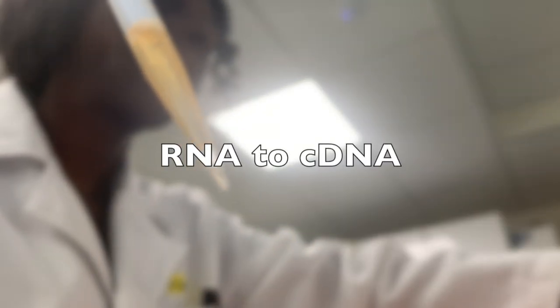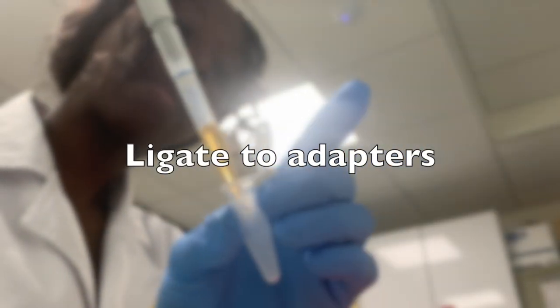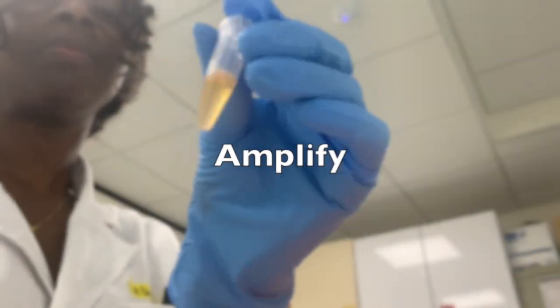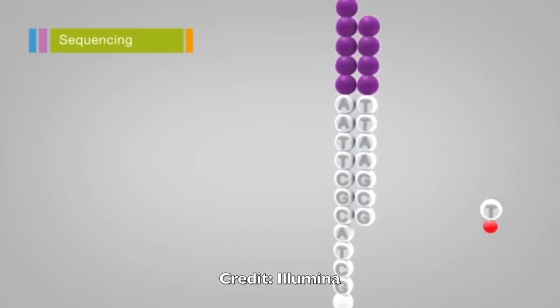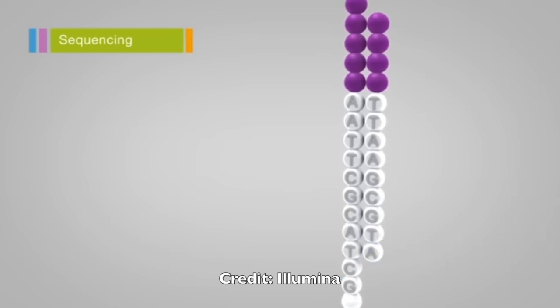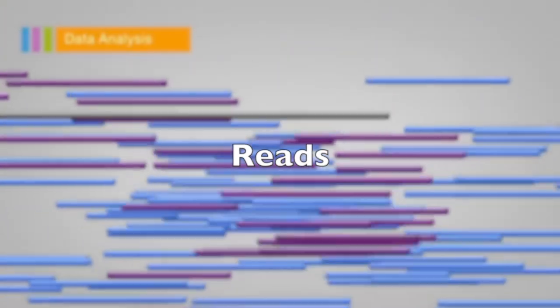So after fragmenting and converting to cDNA, you will ligate these with sequencing adapters, then amplify them, and then you will perform next generation sequencing. So what happens when you do this is that from the next generation sequencing machine, you will get these things that are called reads, and you will then map or align these to a reference transcriptome or genome of the organism that you're working with.